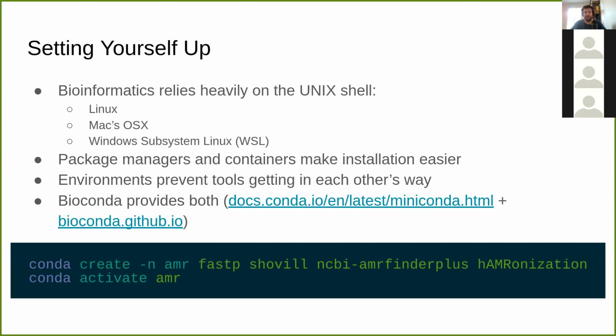There's a tool called Conda, in particular the BioConda channels that you can set up on it, that really provide both of those features: an ability to easily install tools and an ability to deal with bioinformatics tools, especially via Bioconda.